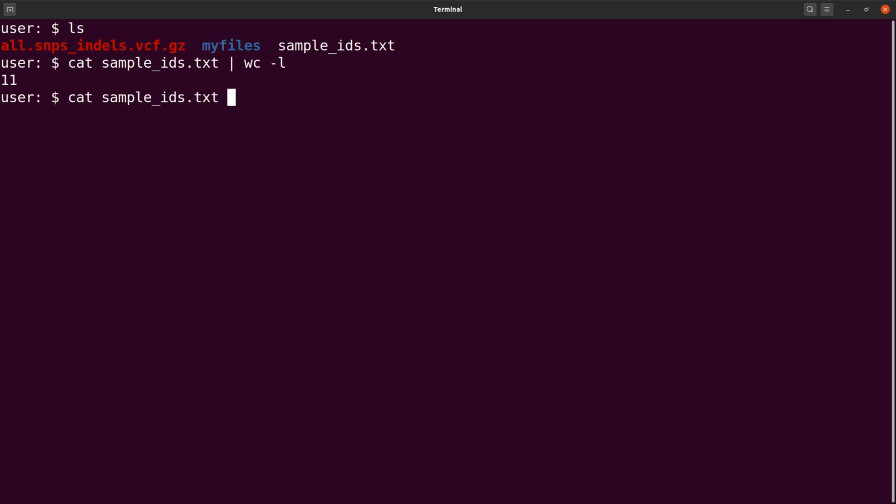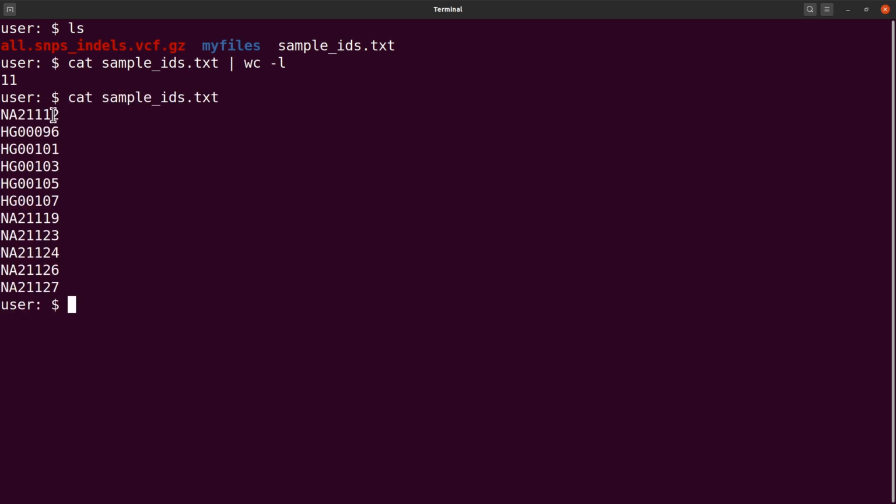Let's just display this one here. Let's count 1, 2, 3, 4, 5, 6, 7, 8, 9, 10, 11. We have 11 samples here. There are 11 of them. Okay, so that's how we do it. If you want to do it straight away, you can also say bcftools query -l, you supply it here and you say pipe wc -l. You'll still have the same thing here. So this is how we do it, and it's very, very simple and easy to follow.